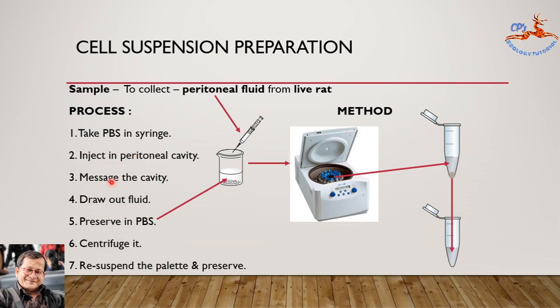Now massage this cavity and wait for 5 minutes for cellular release inside. Then draw out this fluid after 5 minutes — at least 1 ml of peritoneal fluid — using a 5 ml syringe. After that, pour that fluid into the PBS solution kept previously in a beaker. This is done for preservation of this peritoneal fluid in PBS.